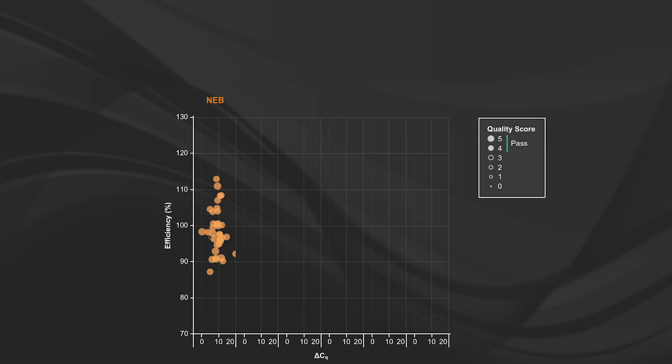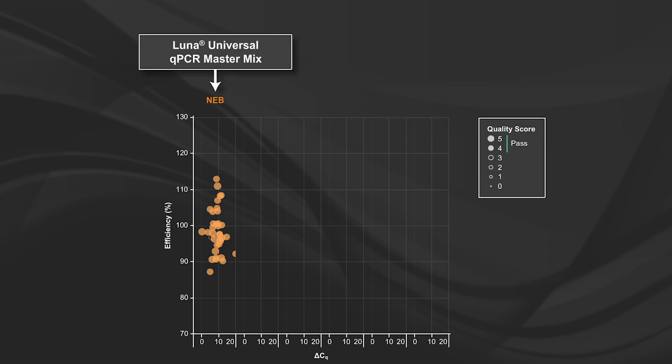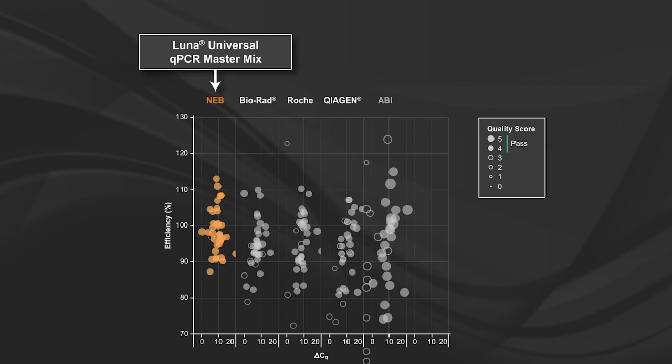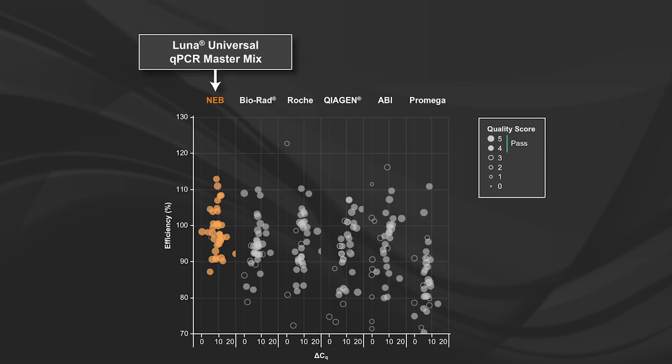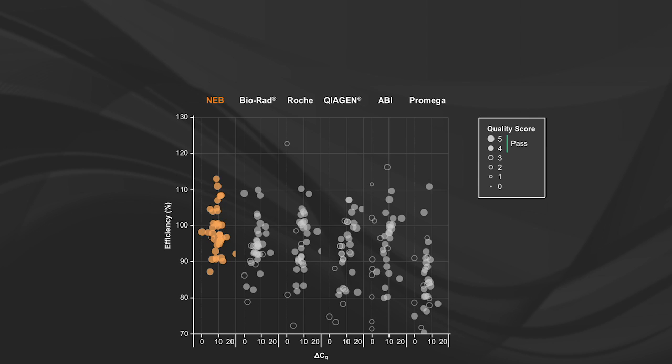For example, here we see the dataset that includes the Luna Universal QPCR master mix compared to a variety of other commercial mixes designed for DNA dye-based QPCR, for example, SYBR, on a total of 18 unique genomic and cDNA targets run in triplicate by two different users.